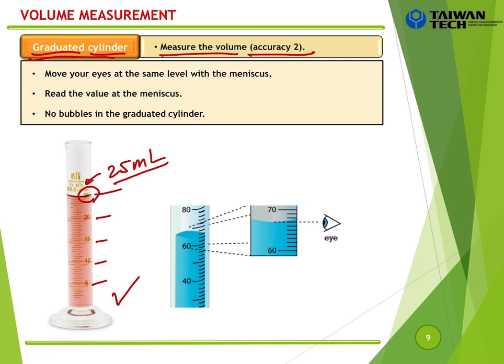So you're already studying chemistry, right? The unit is really important. So you should check the unit on your device to make sure it's in milliliter, or maybe some devices will write liter, so you should know the number here will be in liter. In the level numbers here, they will give you only the value, no unit, and you need to check the unit somewhere here. Okay, and after you get this, you can make the measurement for our volume, because the precision error is very small, and then you can read the value.